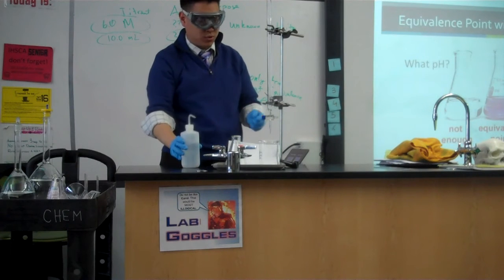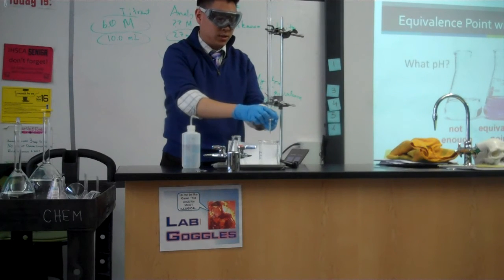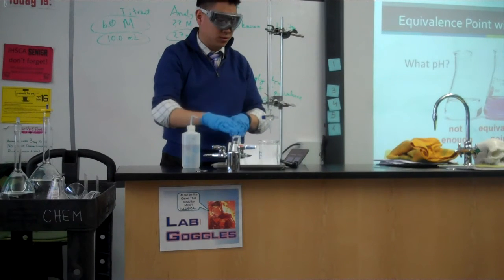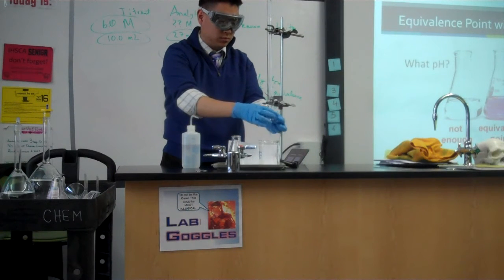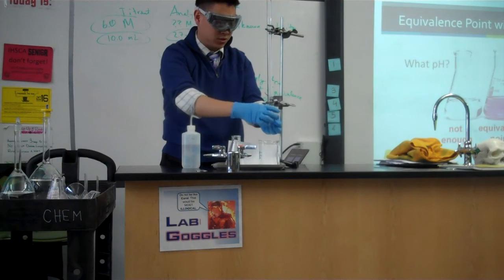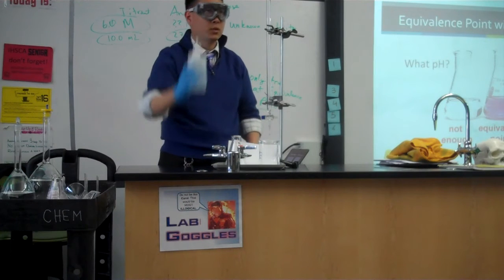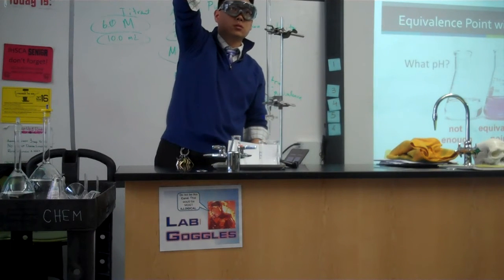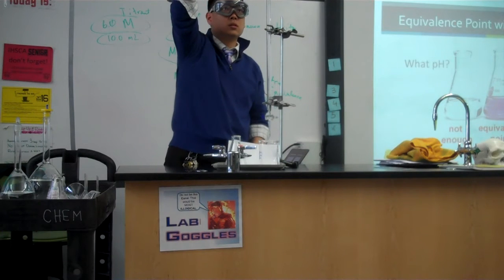Oh, important note. When the burette handle is horizontal, it's closed. Nothing comes through. If it's vertical, liquid will come out. Okay? So when you're pouring this in, you obviously want to make sure it's closed. You can pour your liquid in, squirting water out, trying to clean the inside.